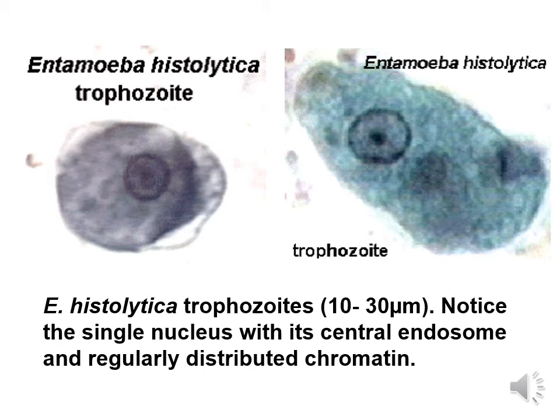Entamoeba histolytica has two stages, the cyst and the trophozoite. So the disease or the dysentery is mainly caused by the activity of the trophozoite. If you see this photograph, you have a larger and a smaller form. That's why the size varies from 10 to 30 or even a little bit more than 30 micrometers, depending on how young or how big or old the trophozoite is.